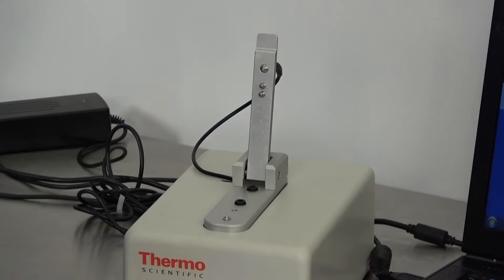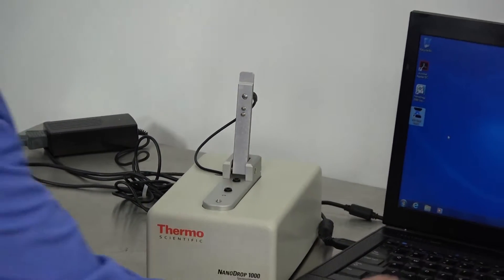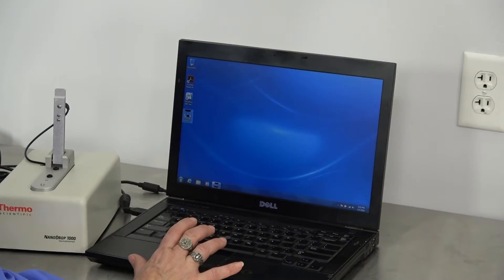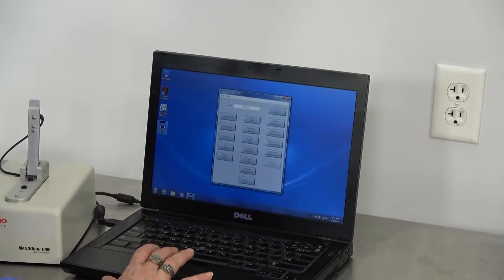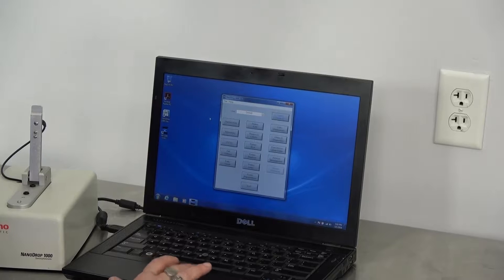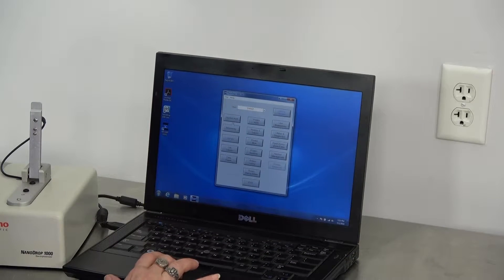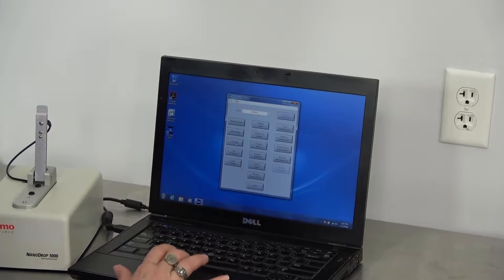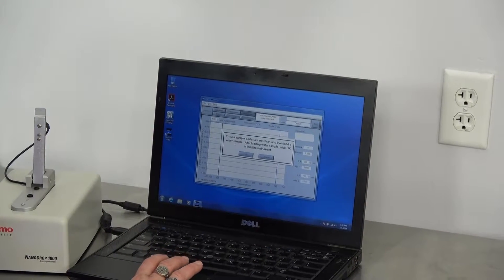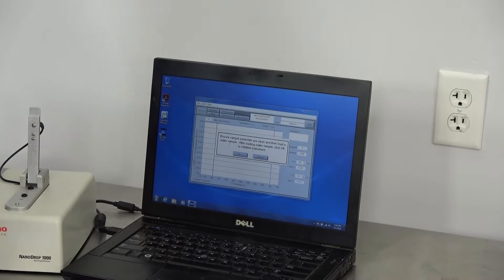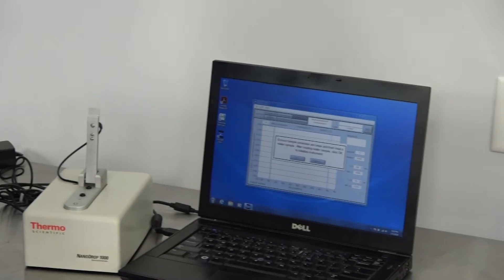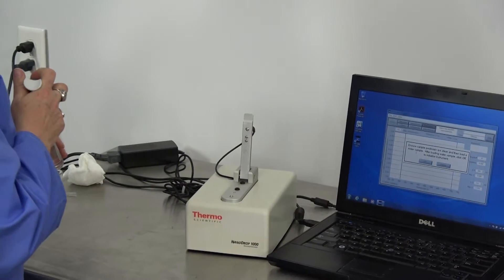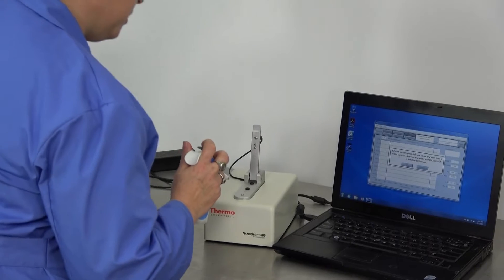It operates with the ND1000 software, which we will open up. We're going to go ahead and run just a sample. It's going to have you clean the pedestals.